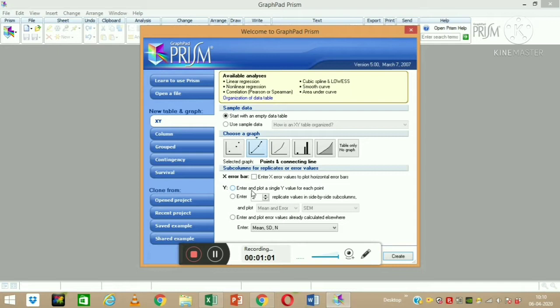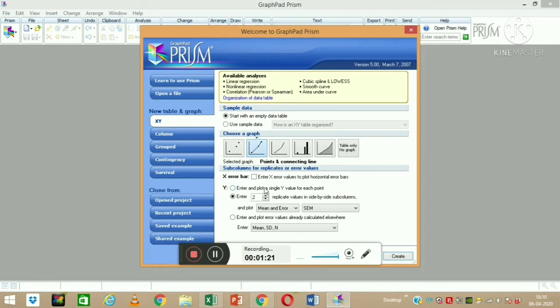If you have only one Y value, you can click on this option. Sometimes we have multiple Y values representing different replicates — in science we try to do experiments in replicates. I'll show you both examples quickly. First, I am drawing an XY graph using a single value, and then I will click on Create.